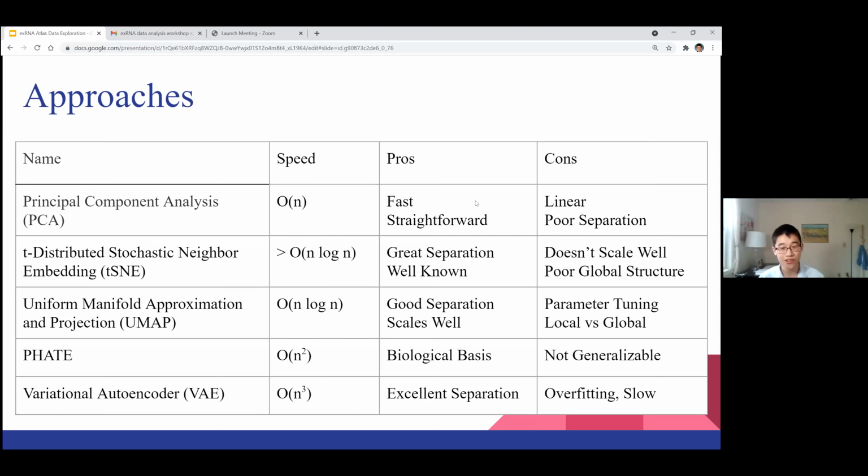And it's pretty straightforward. You can imagine doing a best fit line is an analog to principal component analysis. You essentially repeatedly make best fit lines and express points in terms of projections on those lines to capture as much variance as possible.